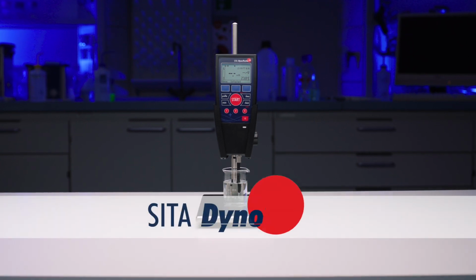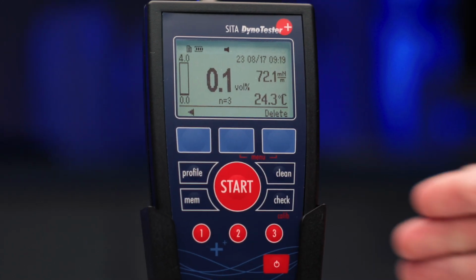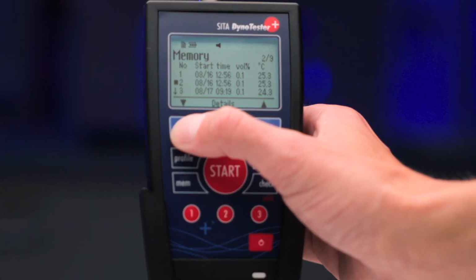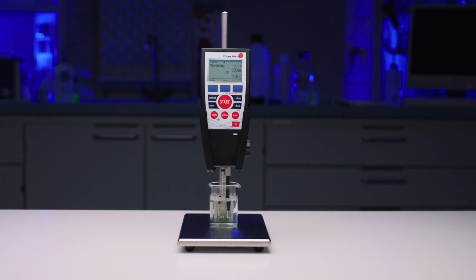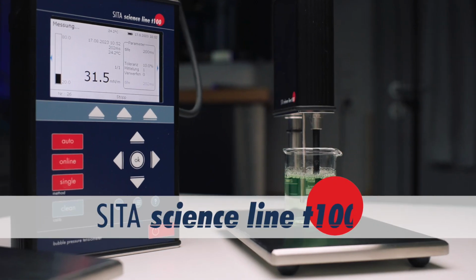The DynoTester Plus is our tensiometer for uncomplicated and fast surfactant control. With the measurement at the touch of a button, user-friendly profiles and easy handling, it is best suited for quality control in industrial applications. Our tensiometers for laboratory use are the ProLine T15 Plus and the ScienceLine T100.